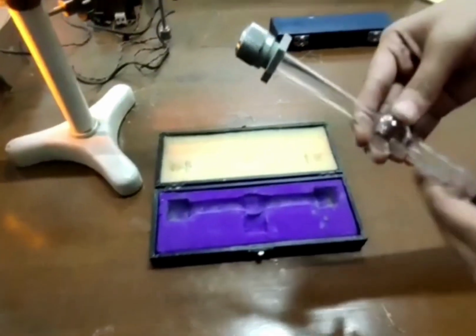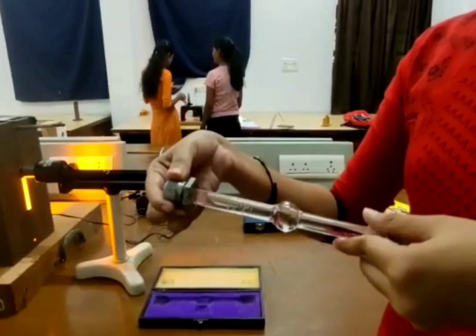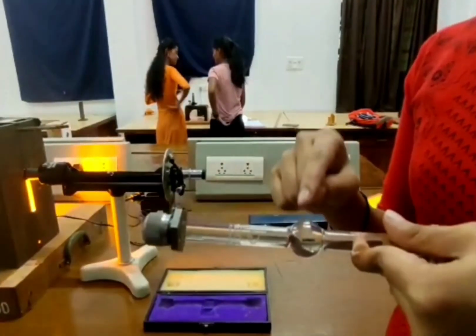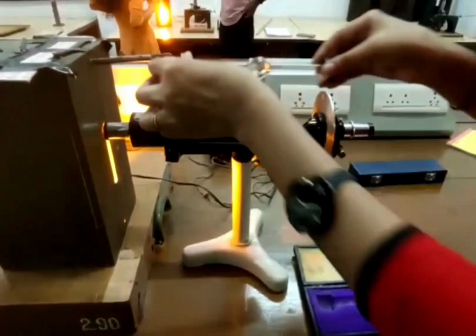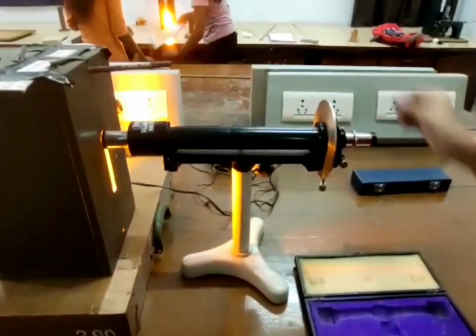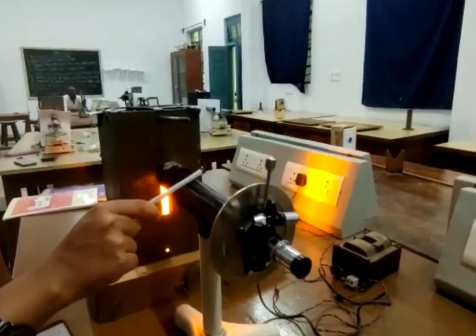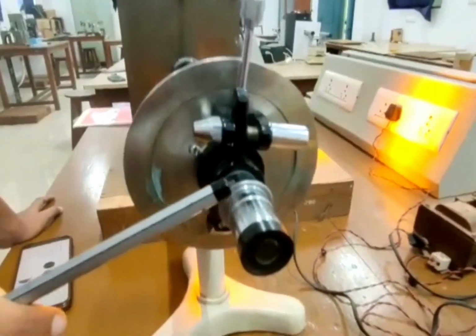First of all, we have to clean the polarimeter tube with water so that any dust particles inside it will be removed. Okay, now we have cleaned the polarimeter tube with water and we have filled it with distilled water. If there is any bubble inside it, it should be minimal and it should be at the center. Now we are going to keep the polarimeter tube inside the polarimeter. Now inside the polarimeter, we have the polarimeter tube filled with distilled water. After that, we are going to observe through the eyepiece and find the R0 value.